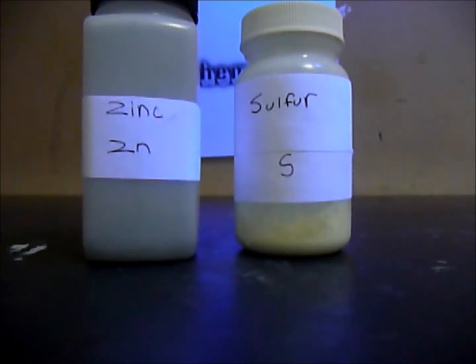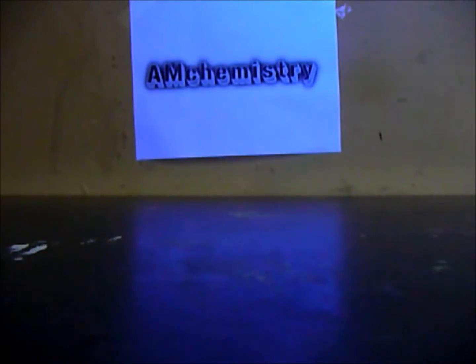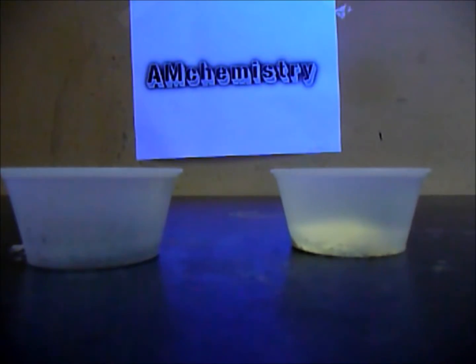So to proceed to the reaction, you have to weigh out 4 grams of zinc and 3 grams of sulfur.